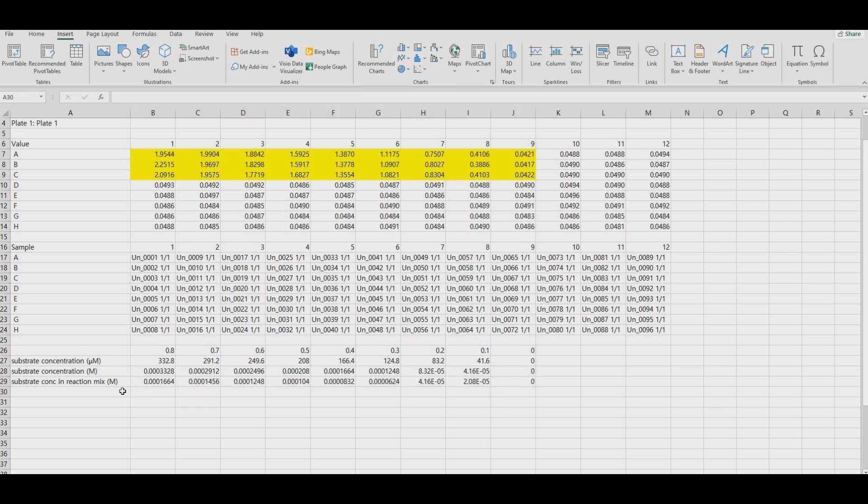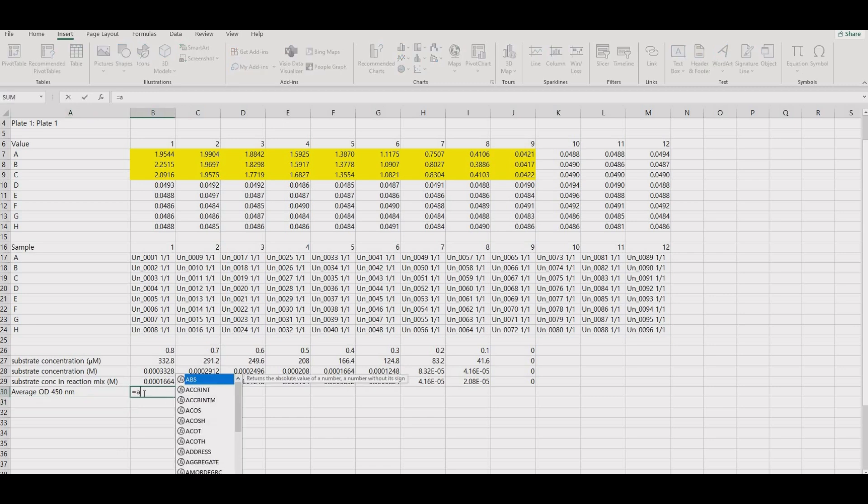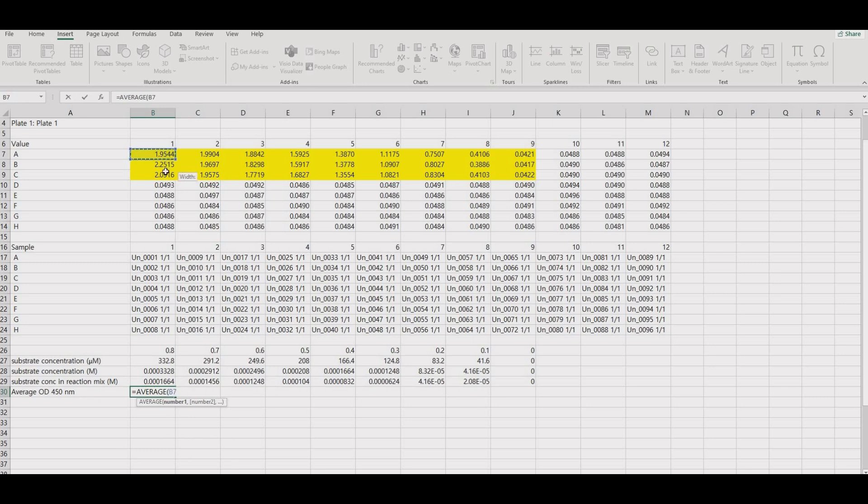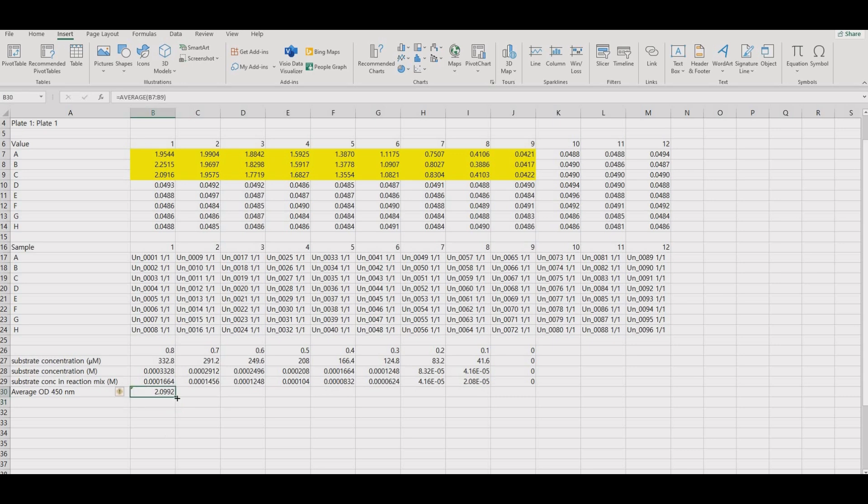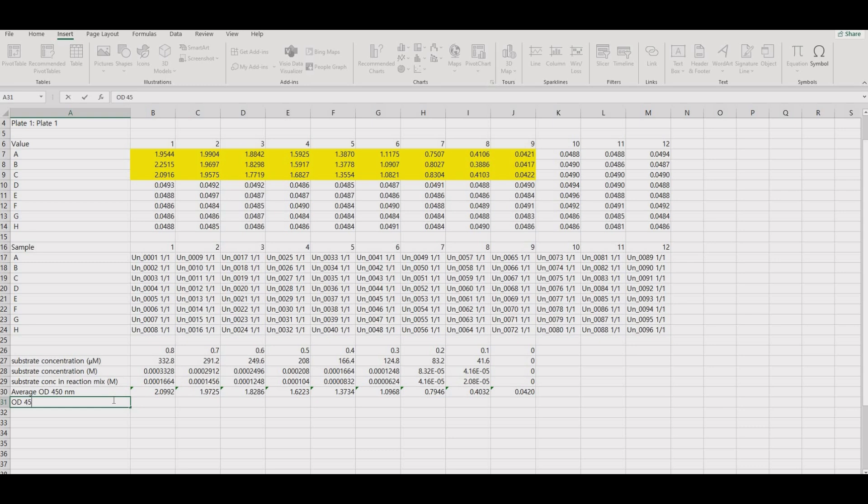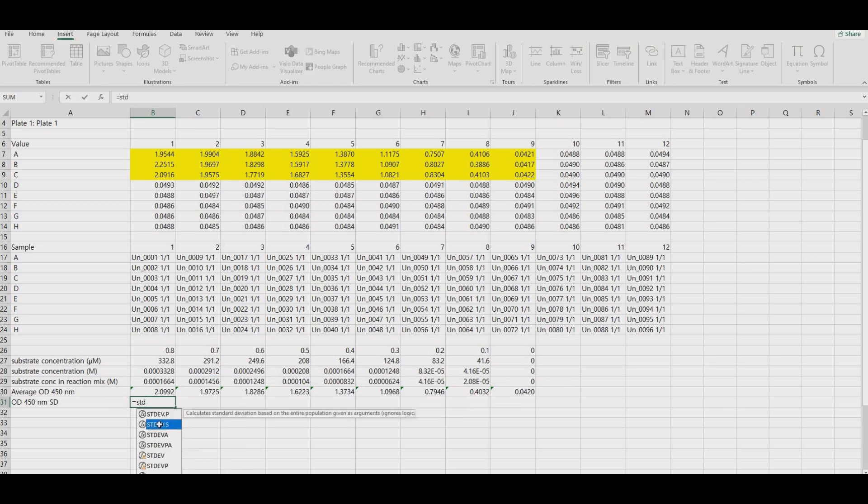Now, take the average of the absorbance values. Take the standard deviation. For the sake of simplicity, we will not be adding any error bars to the graphs. Just take a look at the numbers and be wary if the standard deviation is too high.